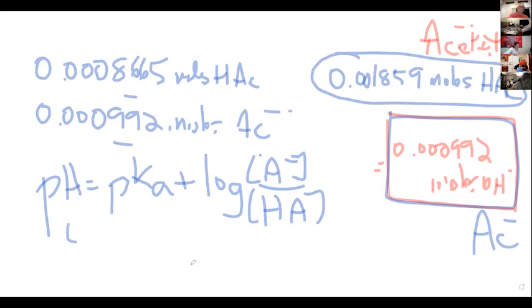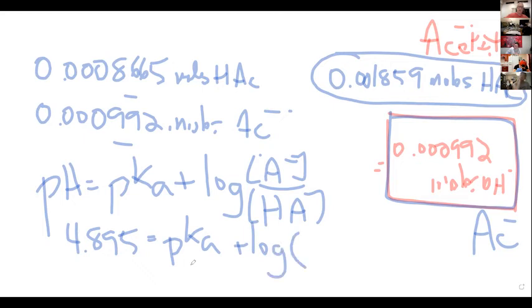4.895. 4.895 equals the pKa plus the log of that ratio, which should be pretty close to 1. 8.664. Yeah, pretty close.